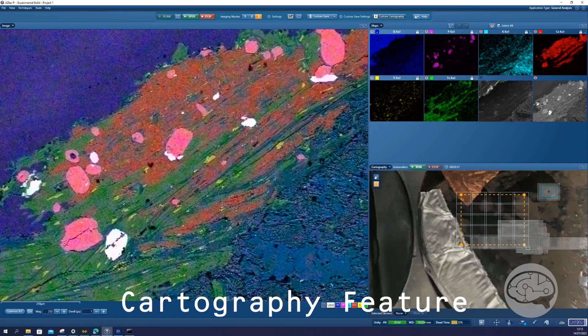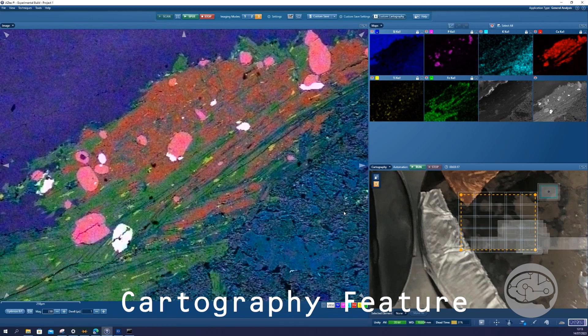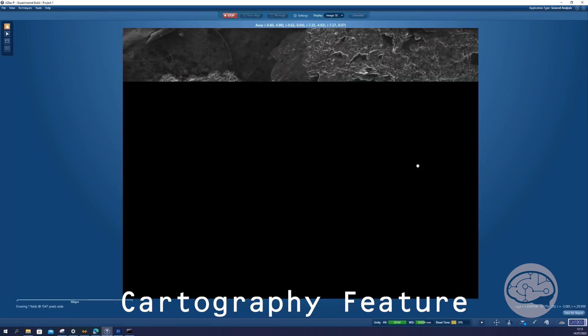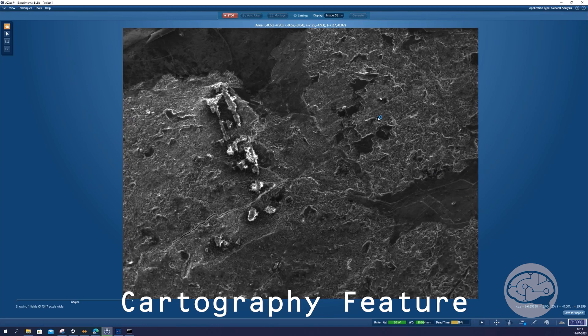The other thing that really strikes me about this is the amount of signal that this detector is going to get off the sample, because it's so near the sample — it's right above the sample. And also, is this going to give us the normal shadowed image that you normally get with an EDS system?